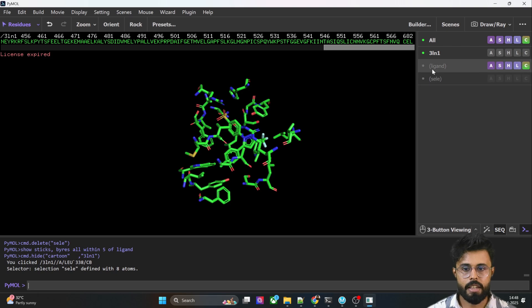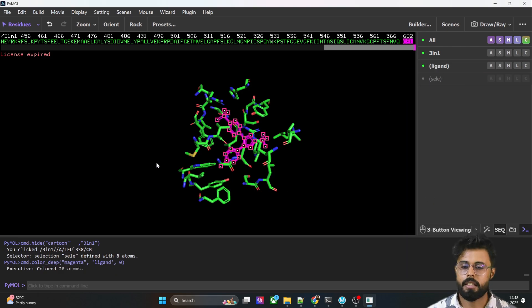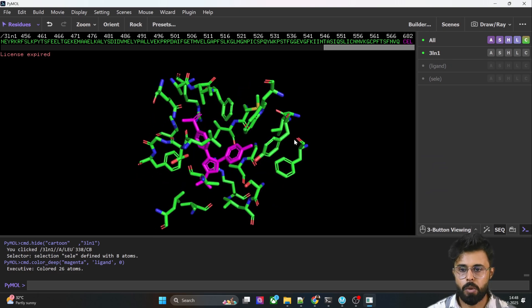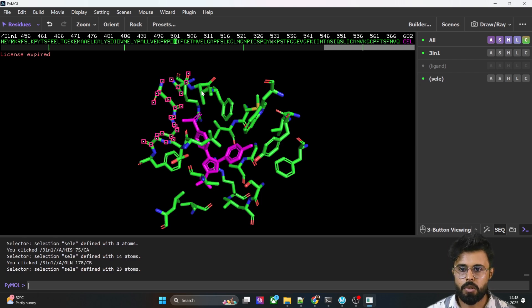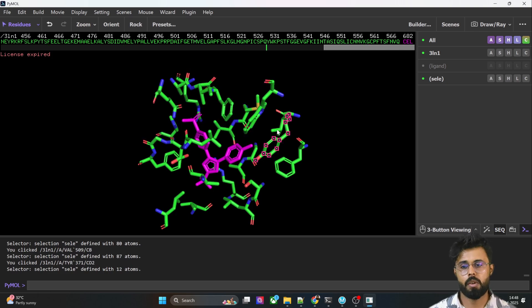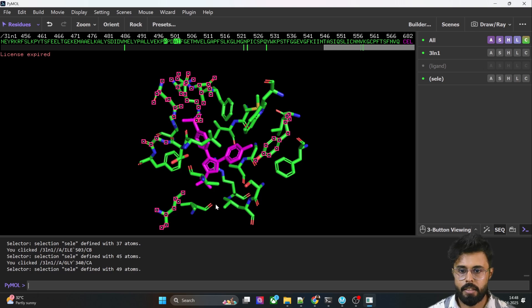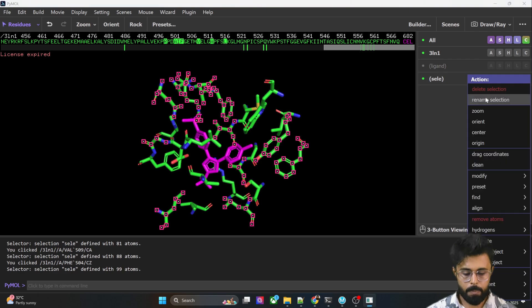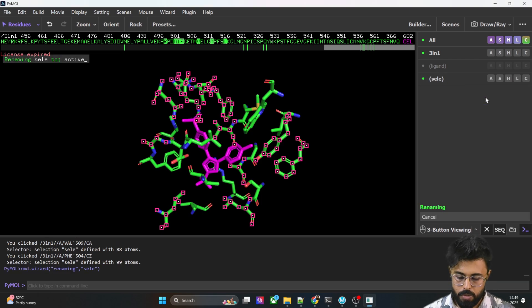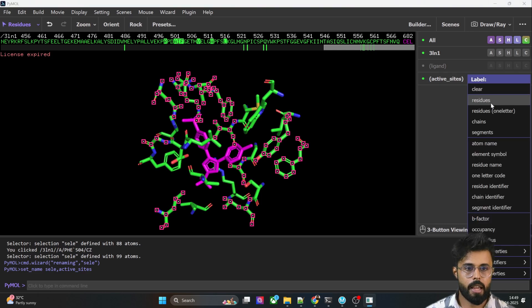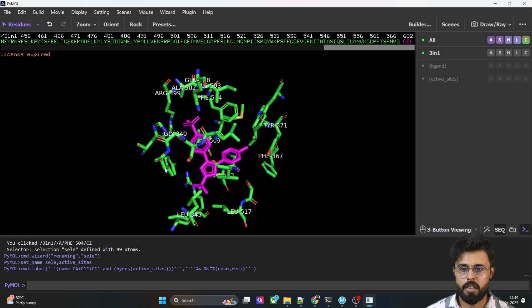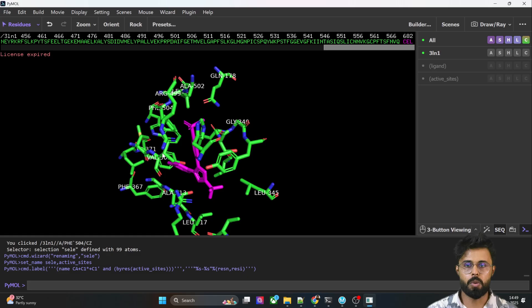To identify the residues in this method, first select the ligand and change it to a different color — I'm selecting magenta. Then manually select the residues by clicking them. I'm selecting some as an example. Change the name of the selection to 'active sites', then go to the Label option and select 'Residue'. All active site amino acids are now labeled.